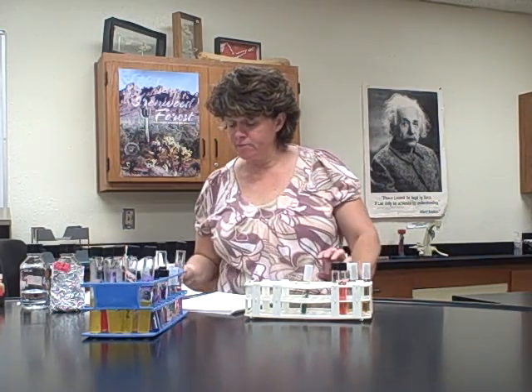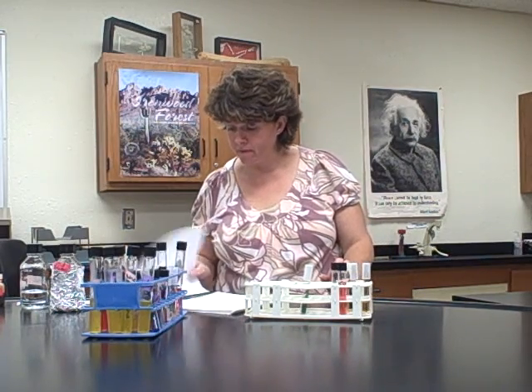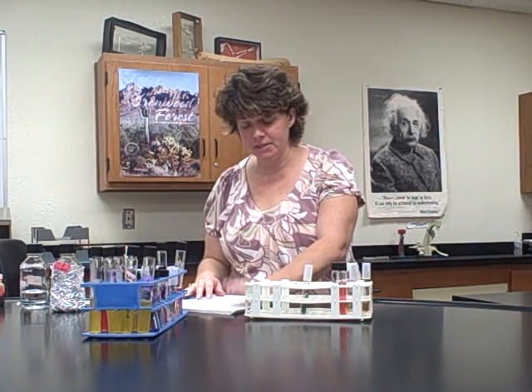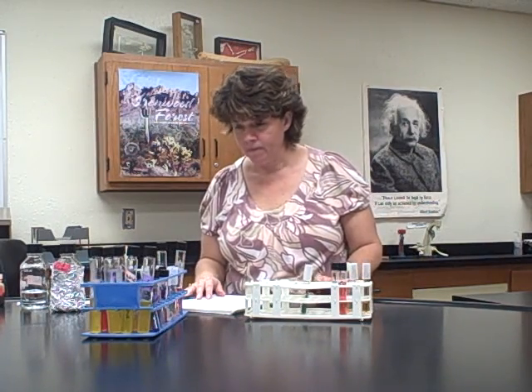So then you'd fill out that entire table and then interpret the results. What does it mean? Okay. Now the next table is going to be the MRVP, which I said we were going to do on another video. Okay, so for this part of the fermentation of carbohydrates, that was all you needed to do. There were two other things that you did. You inoculated that plate with a McConkey agar, and I'm still not sure what we're doing with those plates, so just for now, don't worry about them. When we get to class, we'll talk about them.